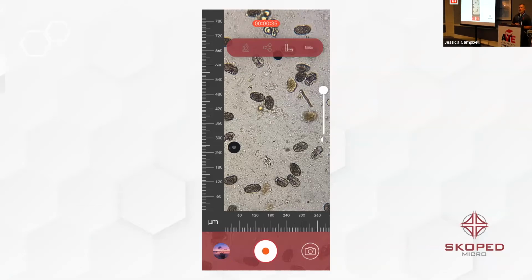One of the first things we actually solved was the ability to broadcast a screen through our app. One thing the pandemic scored on was that I was in a Zoom meeting, and I thought, wait a minute, why can't we just do something like this? We're actually going to do that in a little bit. We're going to broadcast my screen to everybody who wants to play and show how that's going to work. We've got a one-to-one and a one-to-many function. So we'll get to that in a second.